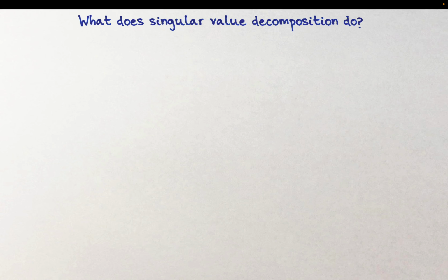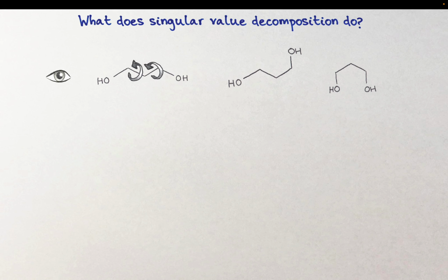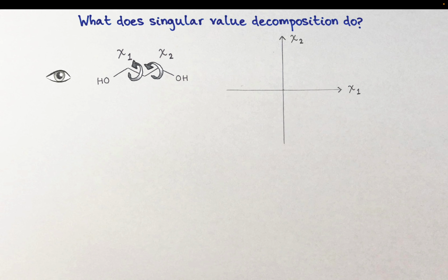Let's say that we have observed a particular ligand in various conformations in a set of protein structures. I've chosen a very simple ligand with two torsion angles, chi1 and chi2, for example. Now, let's say that we draw a scatter plot of all of the values of chi1 and chi2 as they have been observed in these structures. And let's choose a distribution like this.